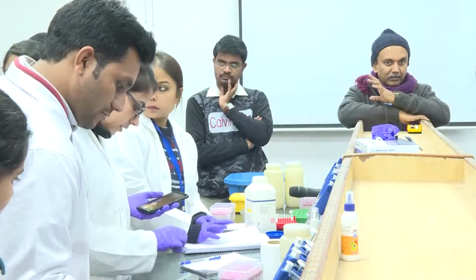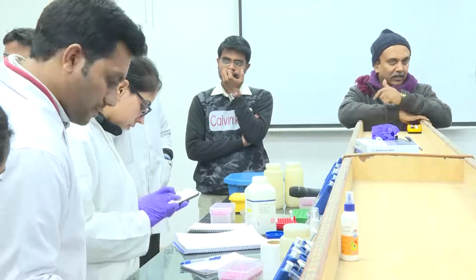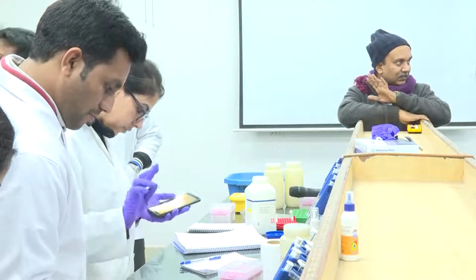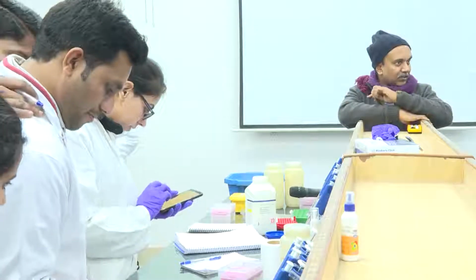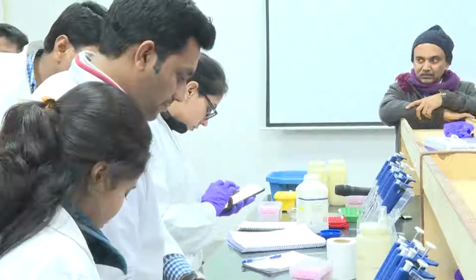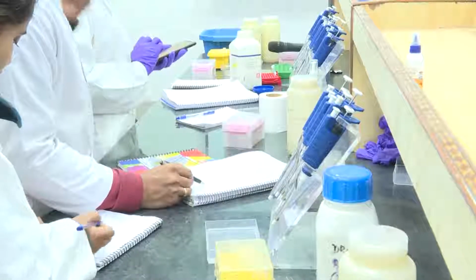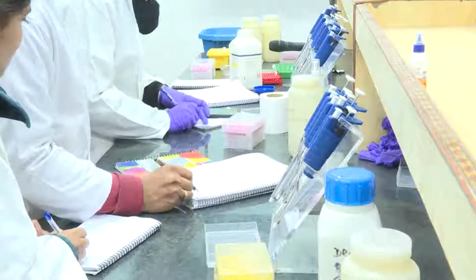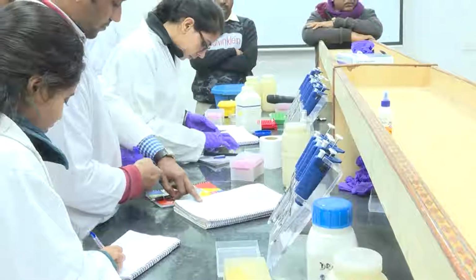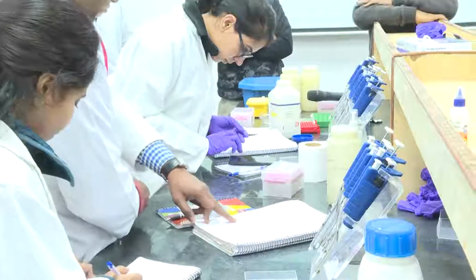Also, your pipette should always be either sterilized or autoclaved, rolled up in aluminum foil, and reserve a set of pipettes only for real-time PCR. Do not use the normal pipette for real time. Although these operations are very simple, if you don't take enough precautions, you may end up with false positive results, which will frustrate you. So avoid those minor mistakes.